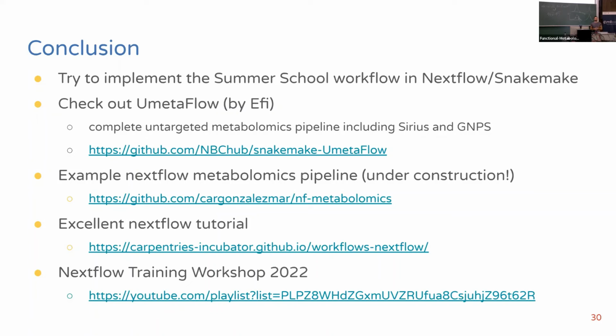For one setting on the machine, for one LC-MS method, in my experience, you don't need to change too much. I use the same instrument all the time. We also usually don't change it much in MZmine.